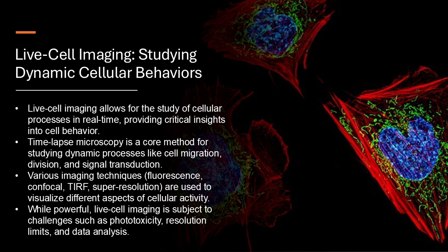There are two main types of these tags. First, we have fluorescent proteins, like the famous green fluorescent protein, or GFP. We can genetically engineer cells to produce these proteins, and they act like tiny beacons, allowing us to track the movement and the interactions of specific molecules within the cell. So we're essentially turning the cells into their own little light shows. That's it, pretty neat.